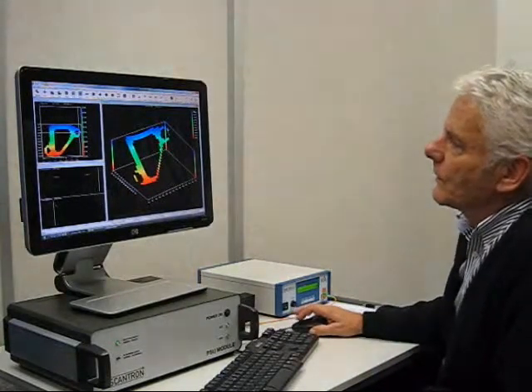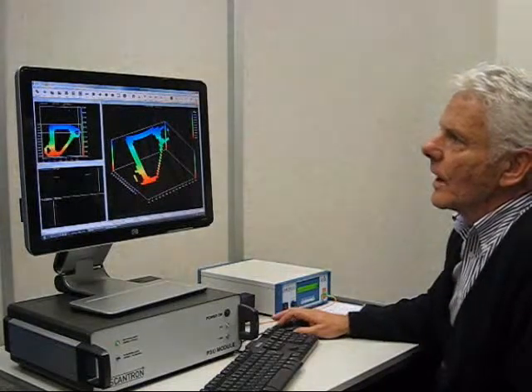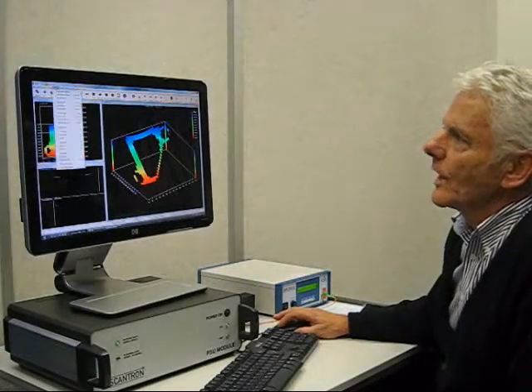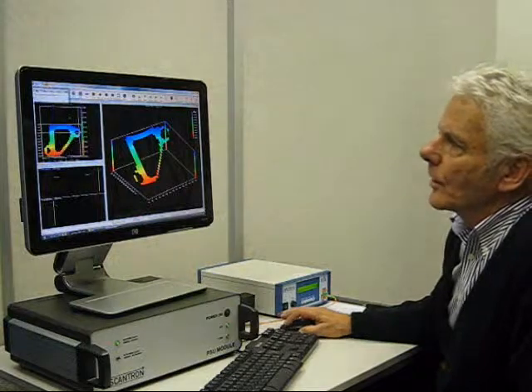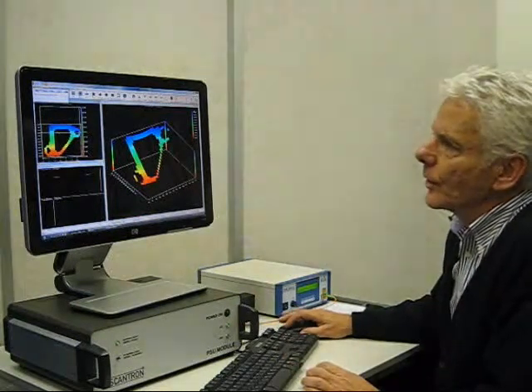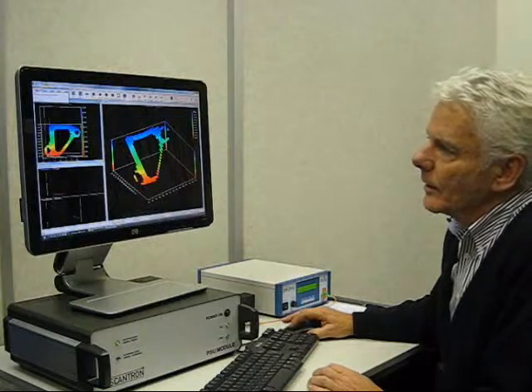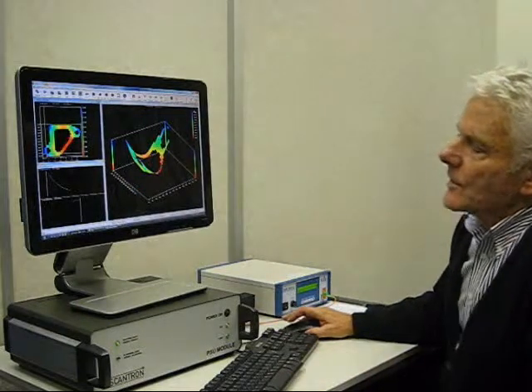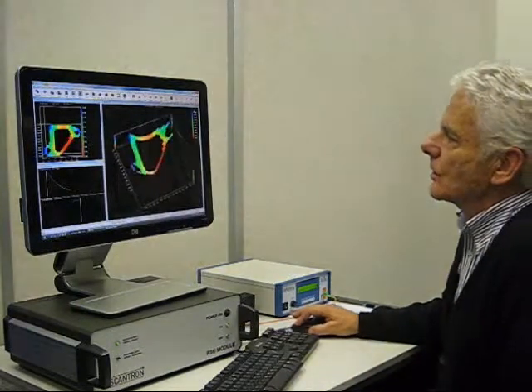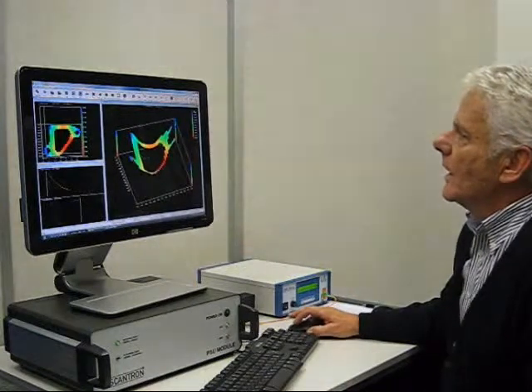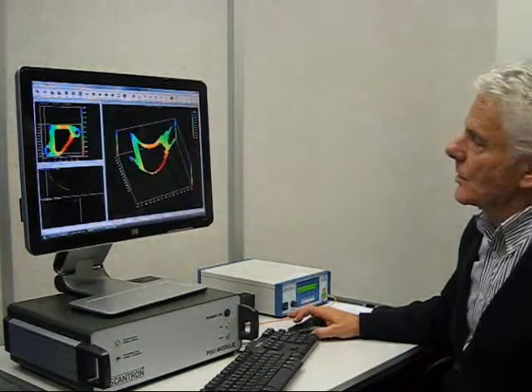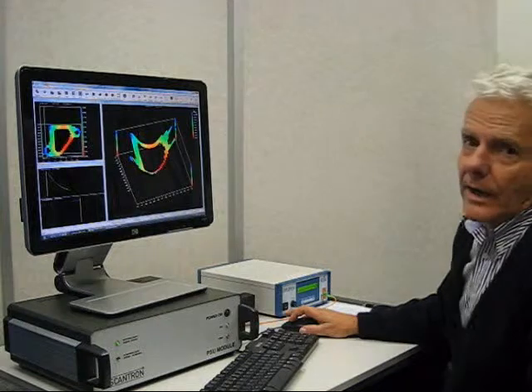To measure the flatness of this surface, we apply three-point leveling by placing one point in each corner of the scan. This levels the scan and shows the actual flatness, which equals the total range of 15.298 microns.